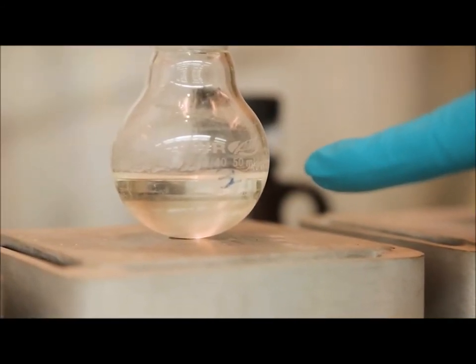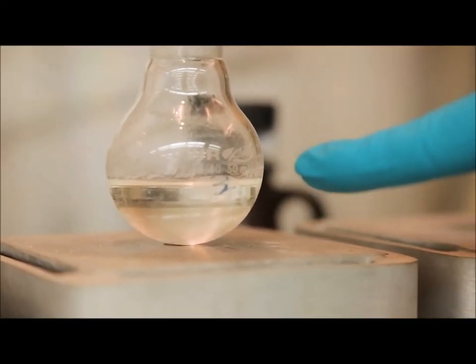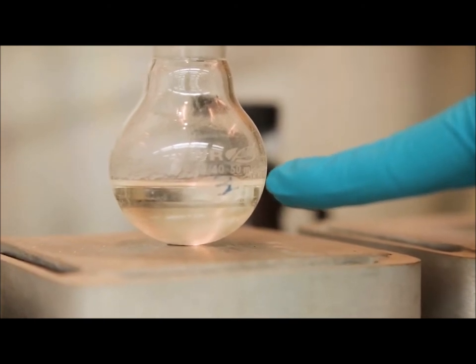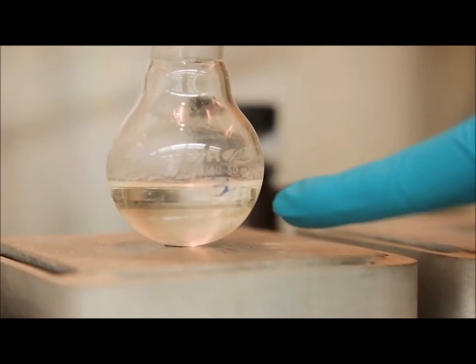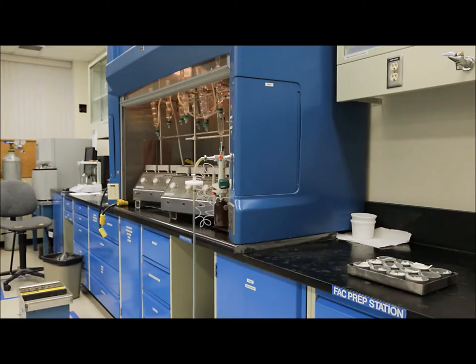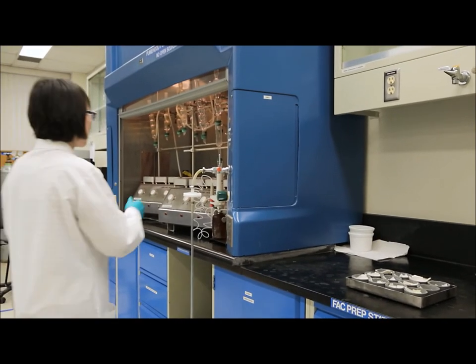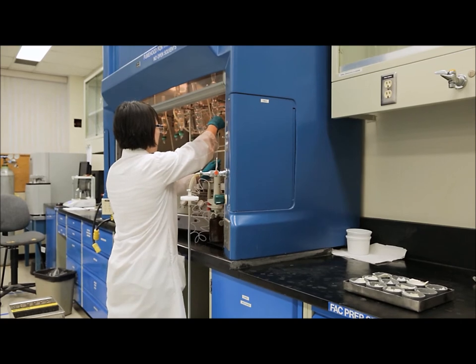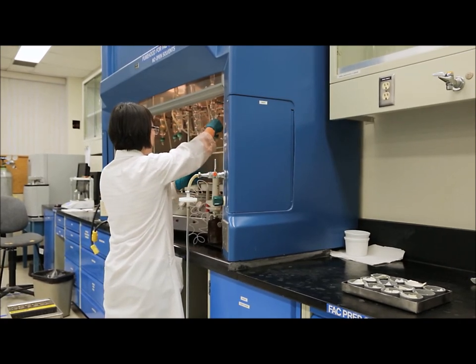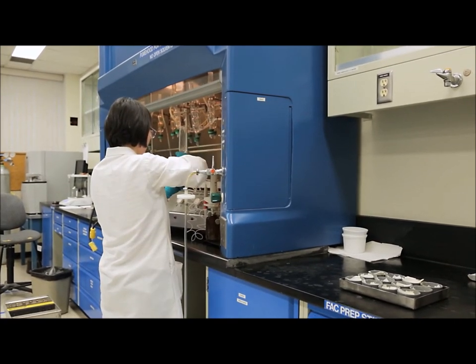Once the sample is cooled, you'll see that the heptane layer has separated out to the top. It is the heptane layer that will contain the extracted fatty acid methyl esters. We can now remove the boiling flask from the apparatus.